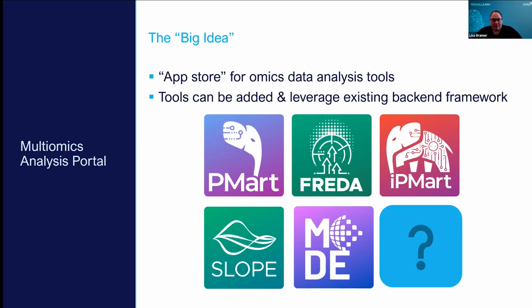So the benefit of this is that we can have distinct types of tools that are useful for certain types of data or certain types of experimental design or certain analysis goals. And we can easily add new tools as new instruments or technologies are being brought online. And we have this backend framework that allows you to pass data from one application to another.